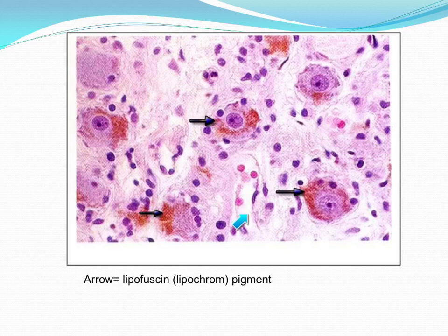Here it is. This is a blood capillary, and all of these are the nerve cells, and this is the nucleus, and this is the nucleolus. So this golden brown pigment is the Lipofuscin. You may be asked to mention another site you know that also has Lipofuscin with the advance of age. The other site is the cardiac muscle.